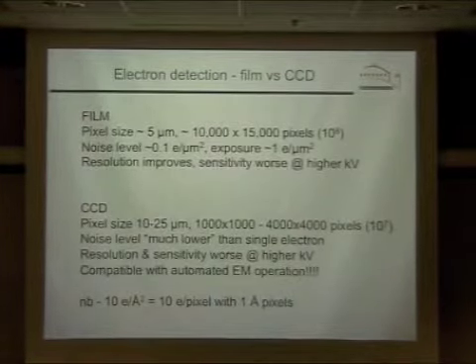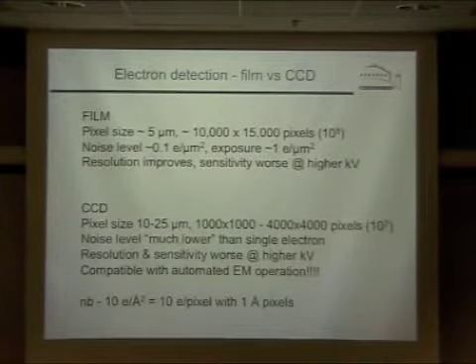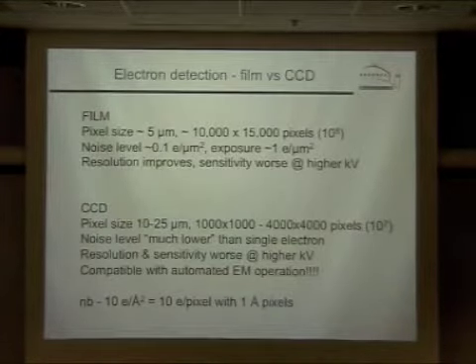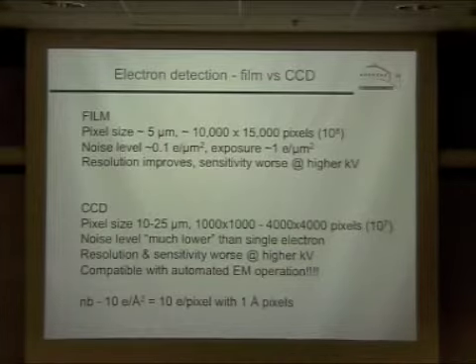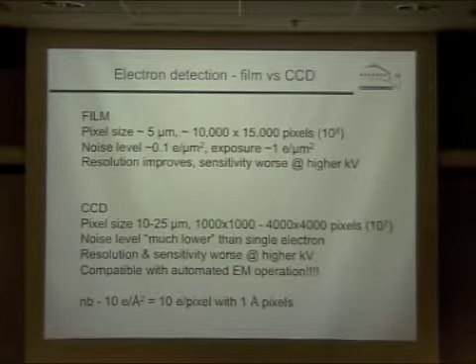Right. So that's a pretty good question. In the case where you have very low contrast, you can approximate anything by some linear function, and the logarithm is pretty linear within a small range of exposure.